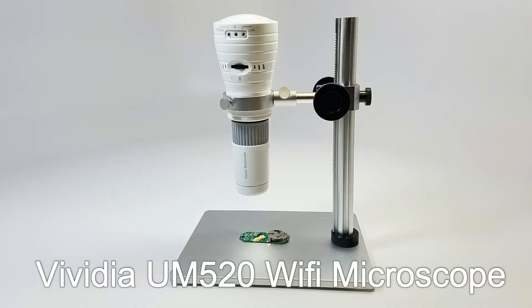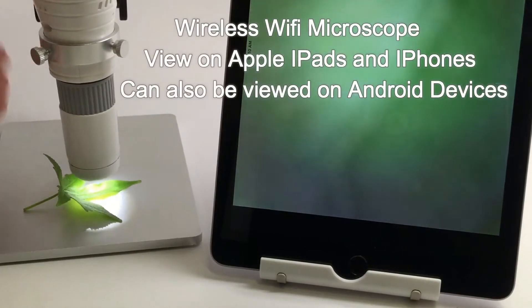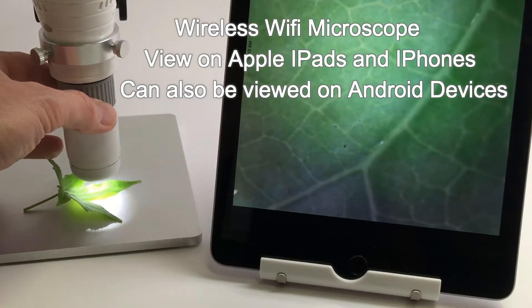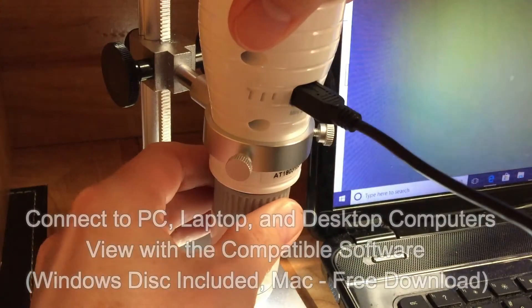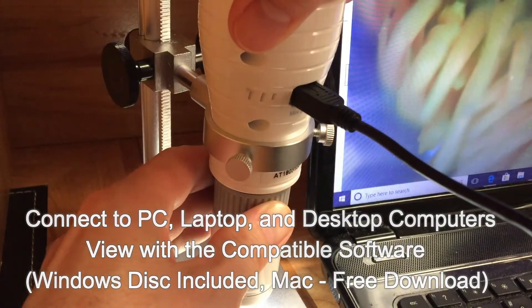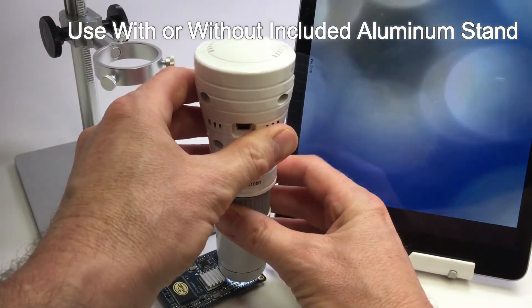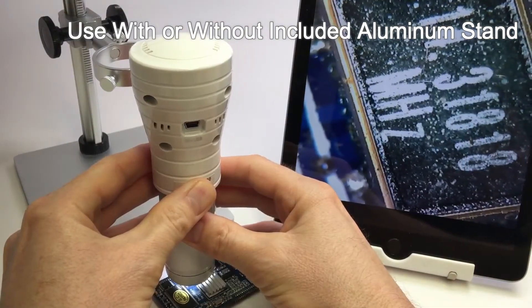The Vividia UM520 is a dual Wi-Fi USB microscope that can be viewed directly from Apple iPhones, iPads, and Android devices, and can also be connected directly to PCs and viewed with compatible software. Ideal for the classroom or learning at home, this portable microscope can be used with or without the included aluminum stand.